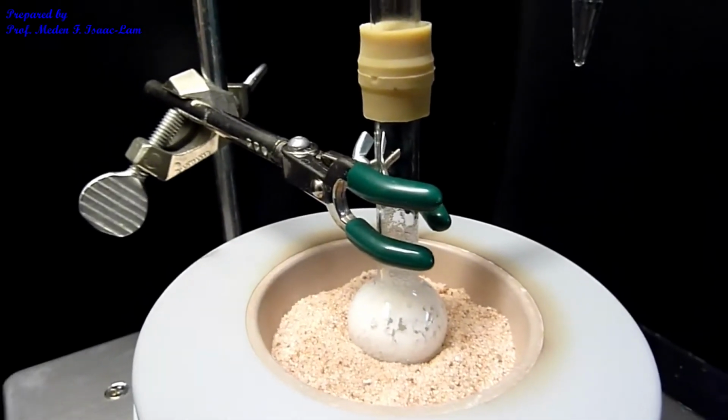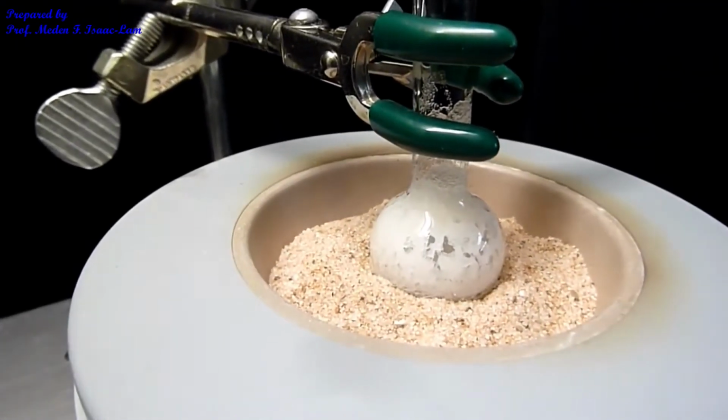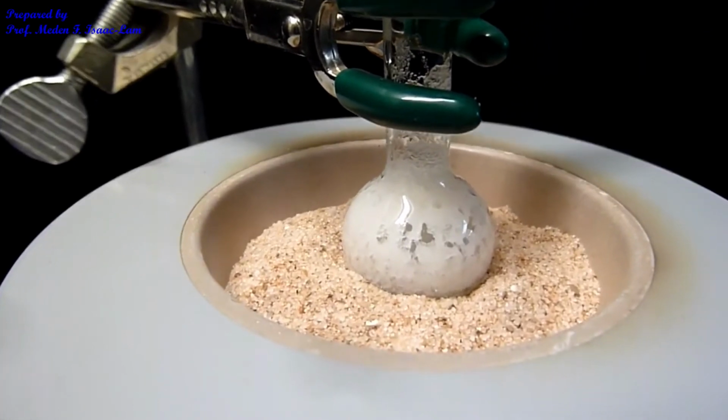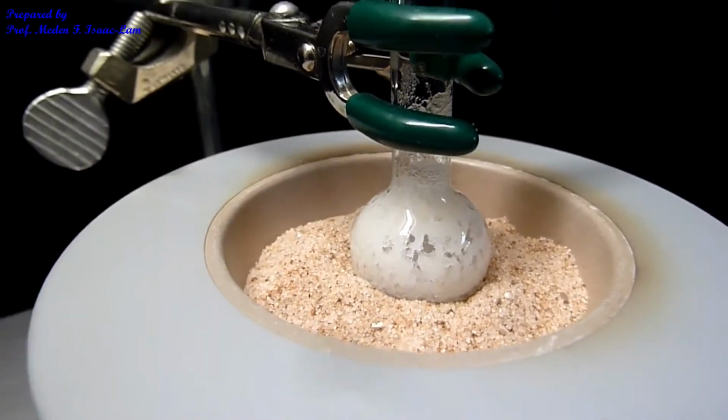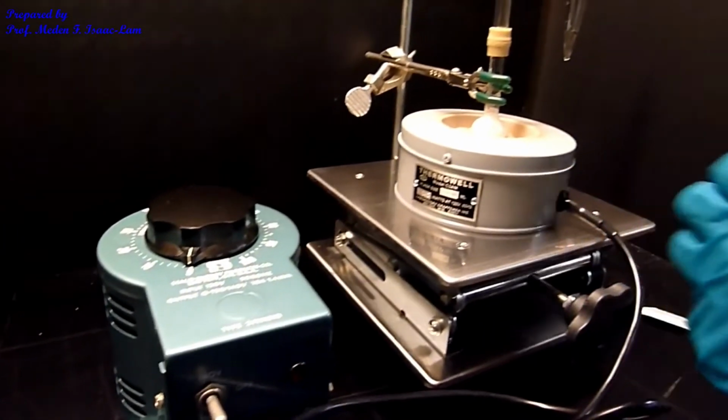So it's been refluxing for 40 minutes. I'm now going to disassemble the setup, and we are now going to do the workup. So I will now turn off, and then I will take it out.